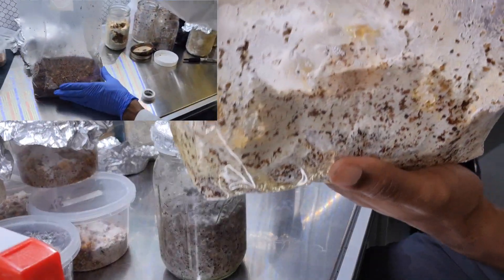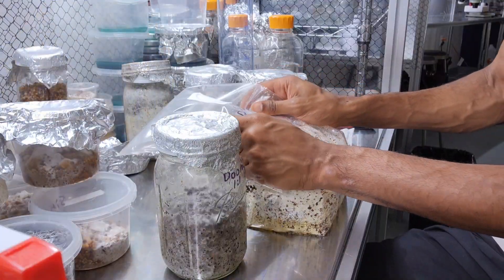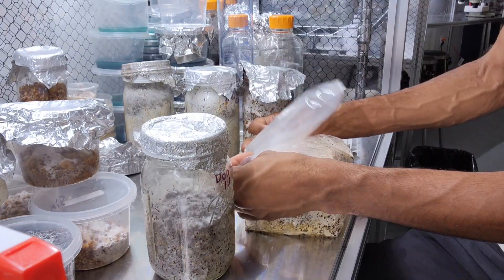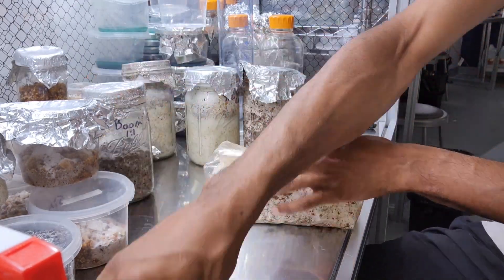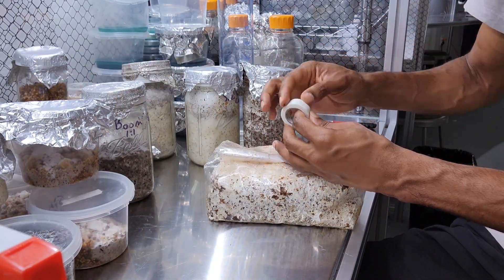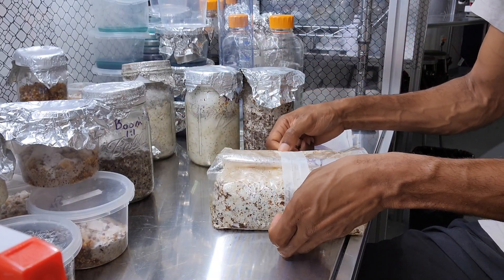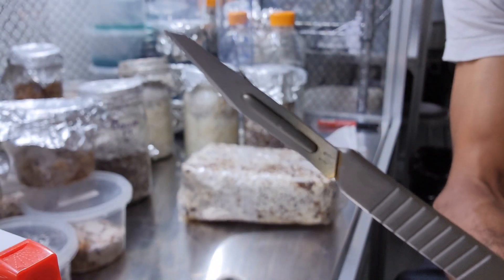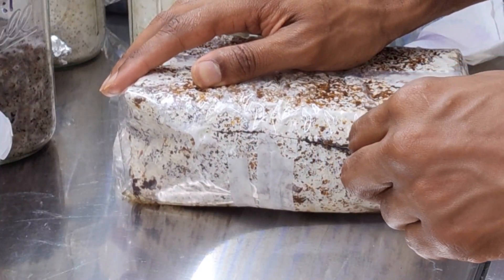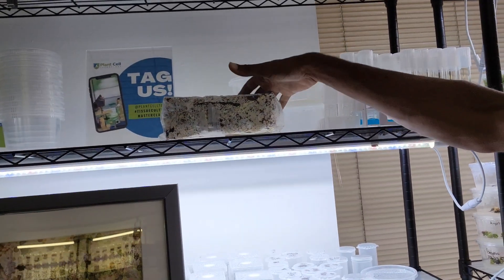First up is our Ganoderma senense that we made in the last video. It's very ready - compared to before it used to be all brown with the substrate and grain spawn, but now the mycelium have jumped off the grain and colonized all of the substrate. So I'm removing all the air from the bag, taping it down, flipping it over so the weight presses the air out, then taking a sterile knife to cut a slit through the bag to give it some fresh air.